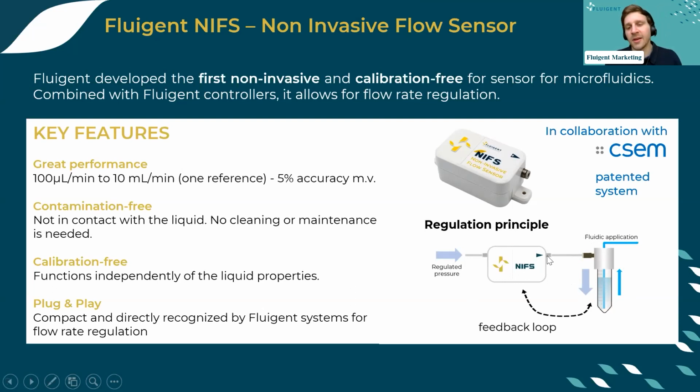I will explain later in more detail how it works, but in a few words, we're measuring the gas flow rate, and we have a completely leakage-free system. And so we can deduce the liquid flow rate out of it.